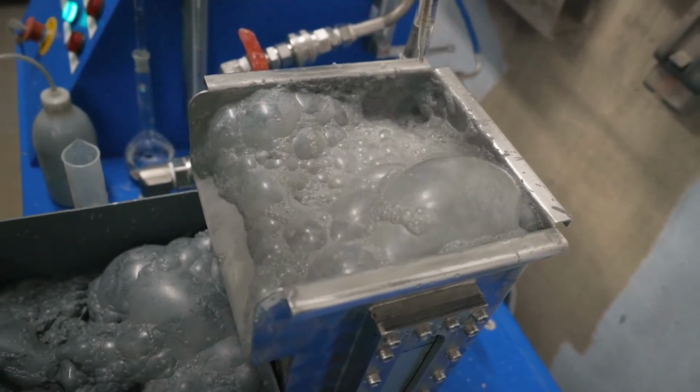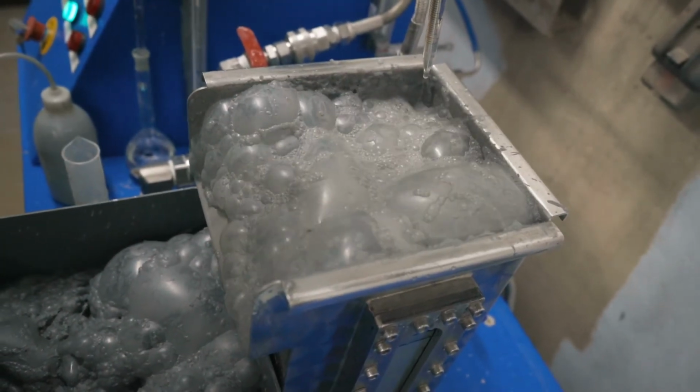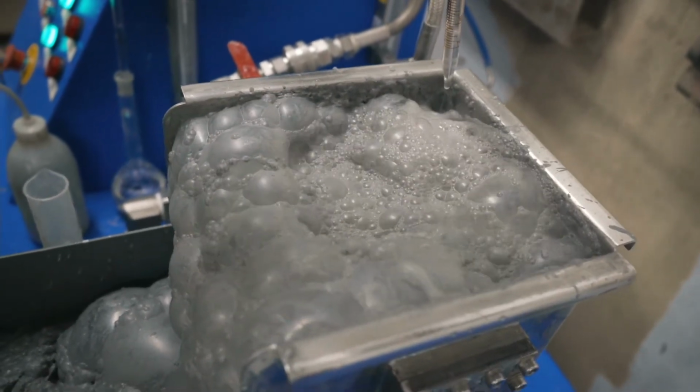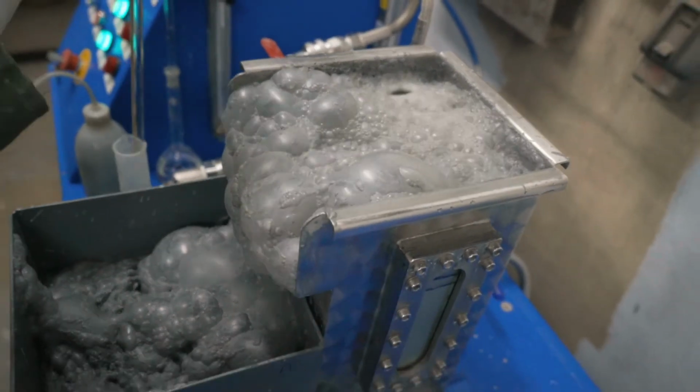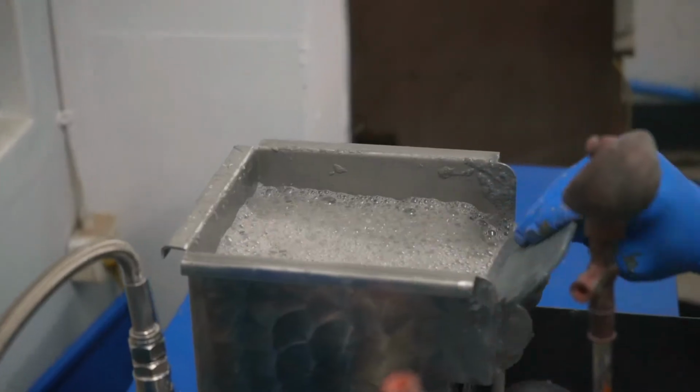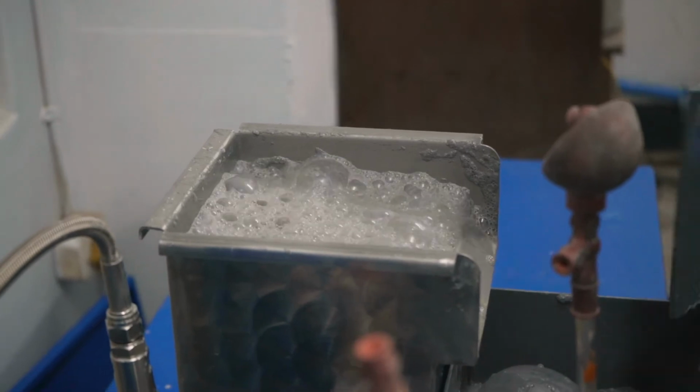So this is Mogalakwena ore, flat reef ore, with very, very fine-grained PGMs. That's normally very difficult to float, but it doesn't appear to be having any troubles floating here.